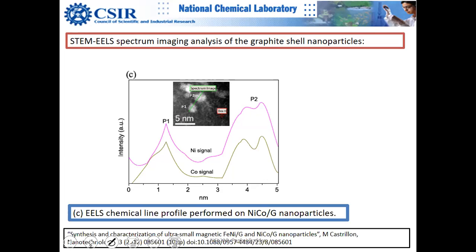This full image, another beautiful image. You can zoom into this area, and wow, I could talk about this for hours. You can see this scale is 5 nanometers, which is very impressive. There are two points, P1 and P2, and this is the corresponding peak for P1, P2. This is intensity, and this is a line scan. You see this green line is drawn.